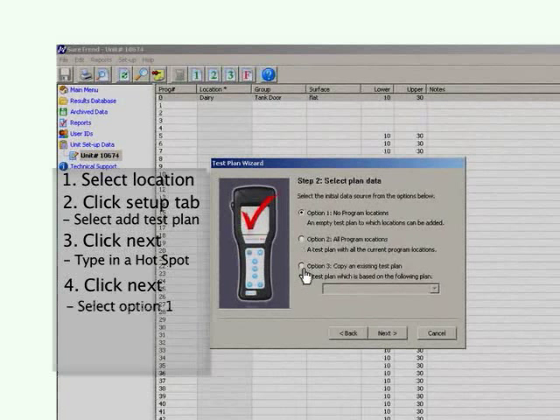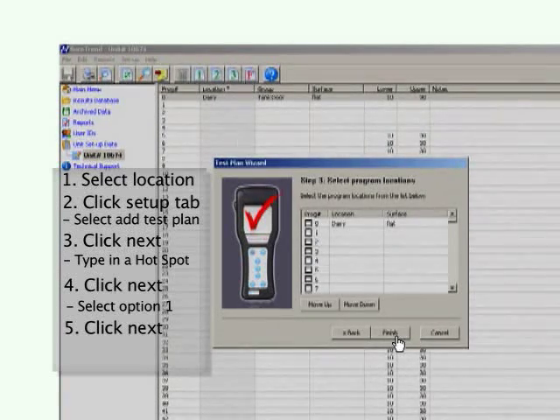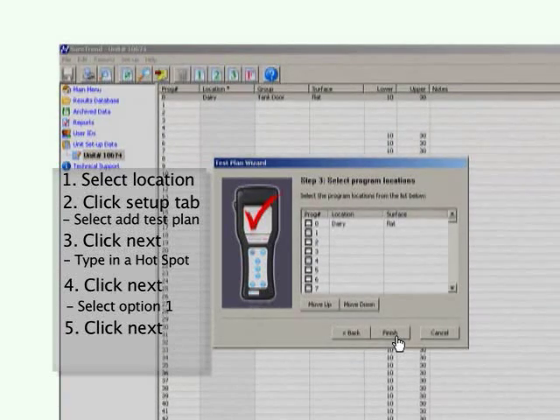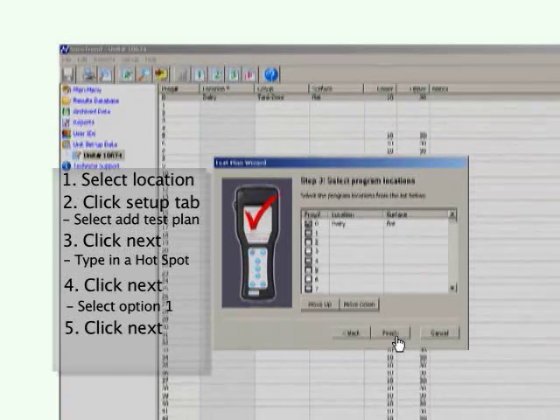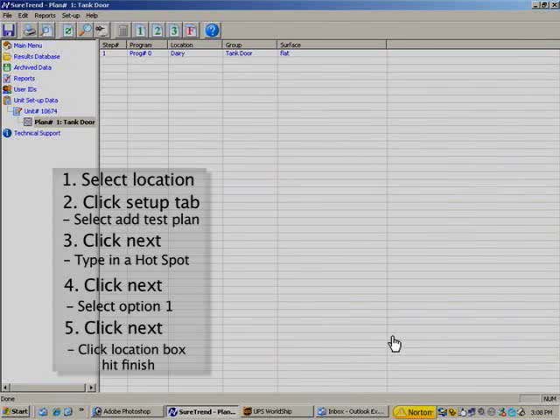Click Option 1, click Next, and the location you typed in your program number page should be visible. Click the box next to the left of the location and hit Finish. Your test plan is now assigned to your test location.